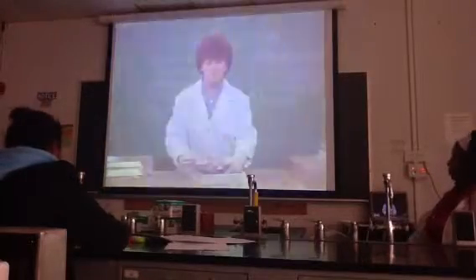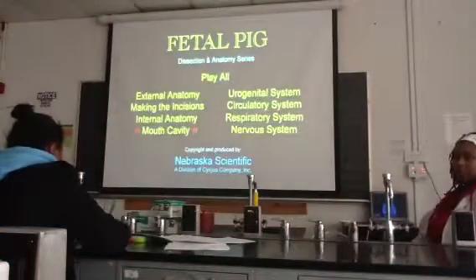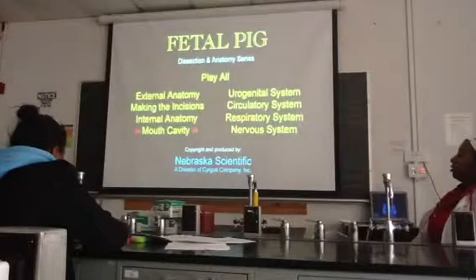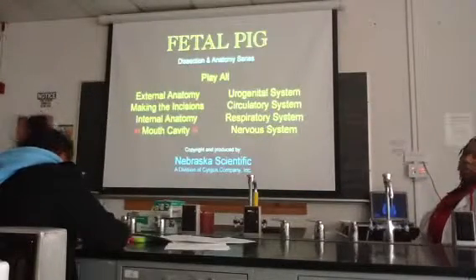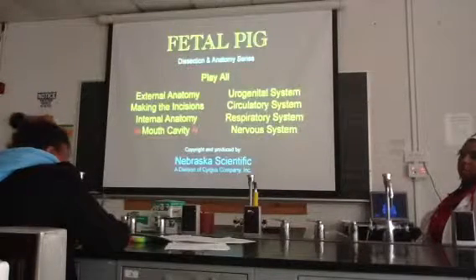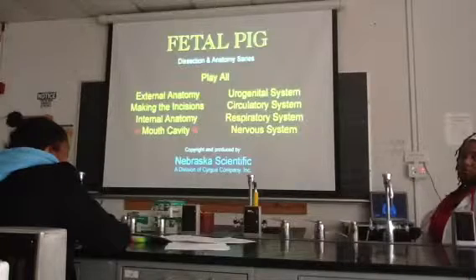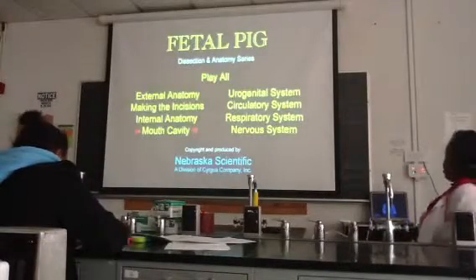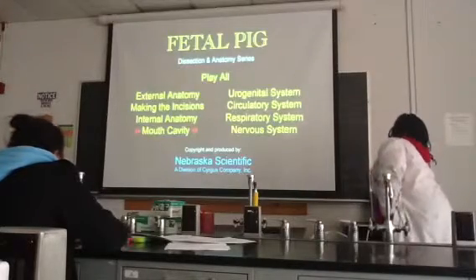Wow, that was really short. Everyone got their 3 to 4 structures? Yes. So, just a question. What's different about a baby pig after it's born than a human after it's born? Based on what you find in the mouth cavity. We don't have teeth, the pig already has teeth. That's crazy.